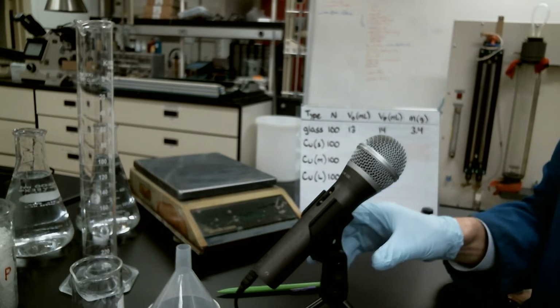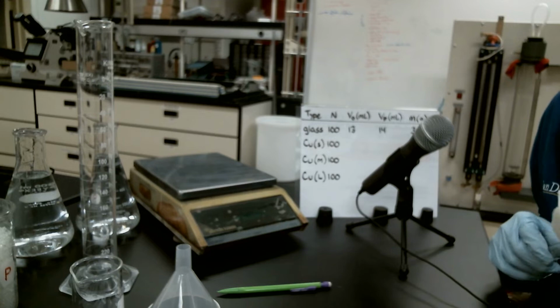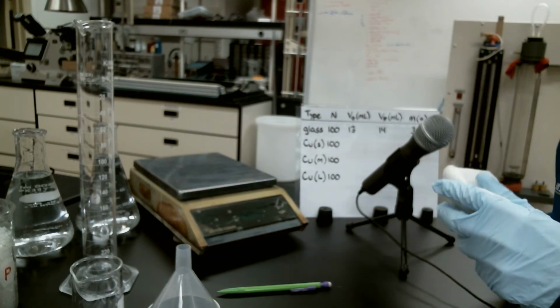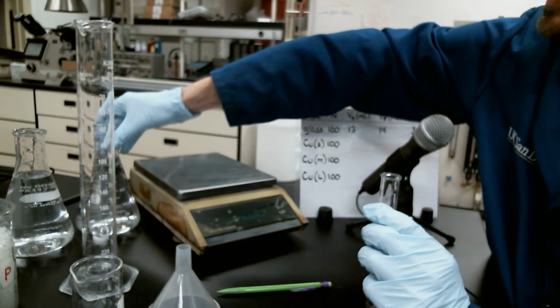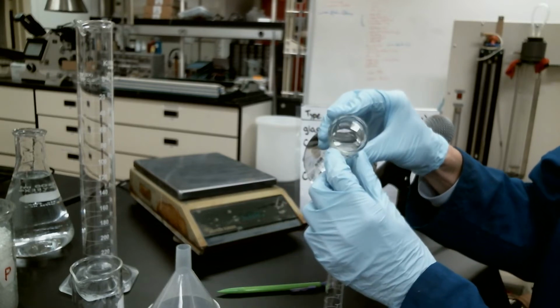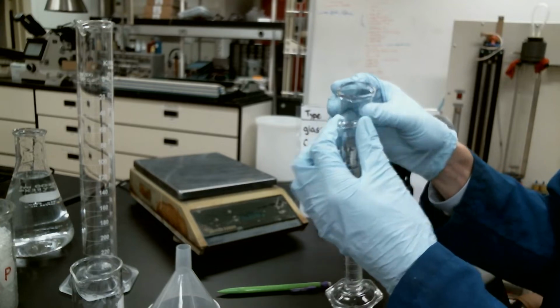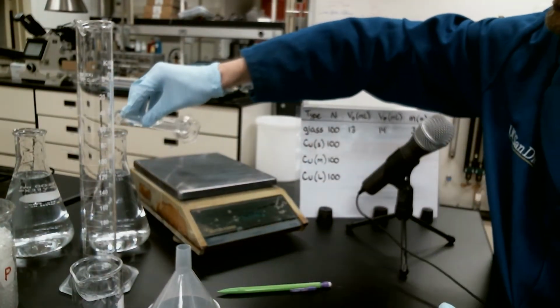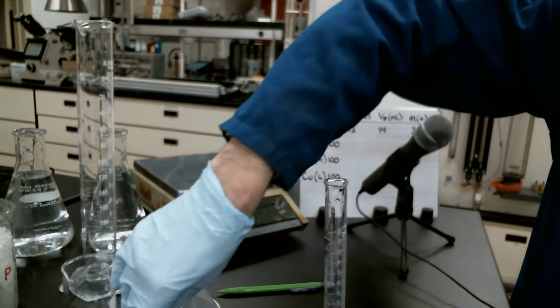And now we're going to move on to our, I'm going to put the microphone over here. Hopefully it'll stop focusing on the microphone quite so much. But we'll see. Go ahead and do exactly the same thing, except now we're going to do this with the copper spheres. So I'm going to add a little bit of water back in here. Should be good. Actually, that's a little bit too much water. I'm going to take some of that out. There we go. That's not bad.